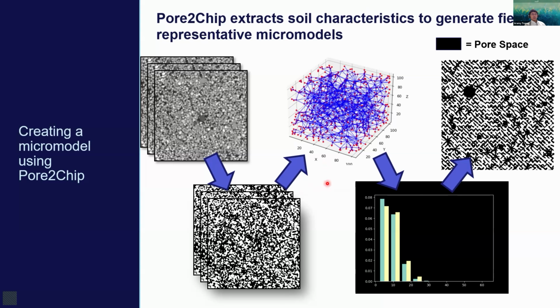And again, this is completely robust. If you had data that was, for example, extracted by Billy already, so let's say he can give you the pore connectivity numbers or the pore size distributions, you don't have to go through all of these initial steps. You can go straight to making your micromodel. We're just providing tools so that if you started from nothing, you could get to a micromodel. Although we do highly recommend, if you submit a code, to have us do the image analysis, because we have an actual human that's doing the segmentation for us for the pore segmented images.